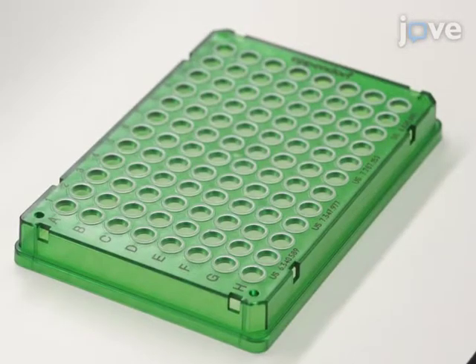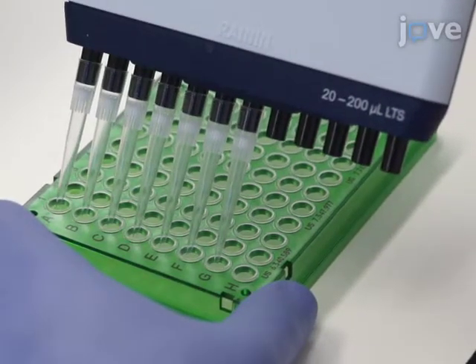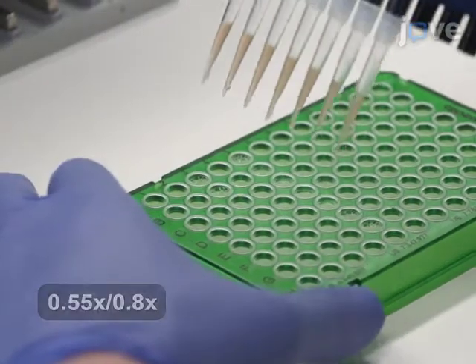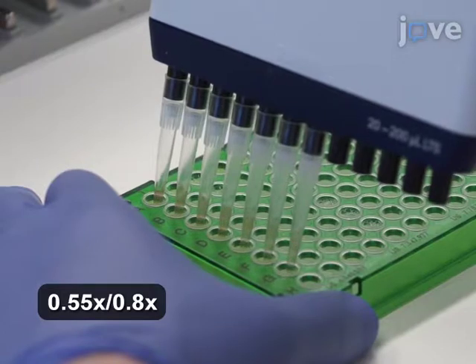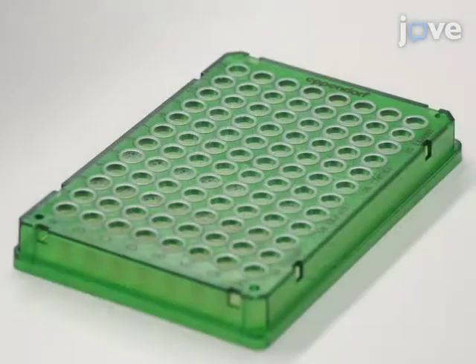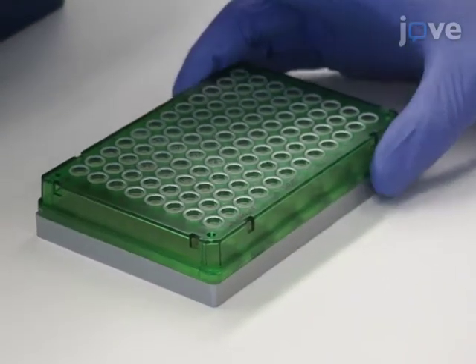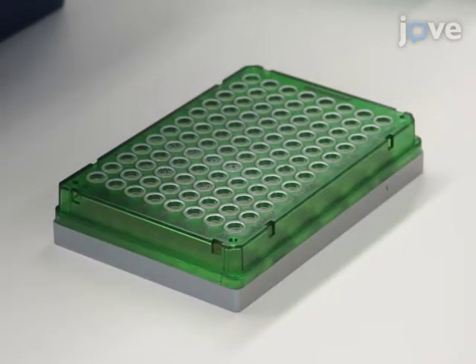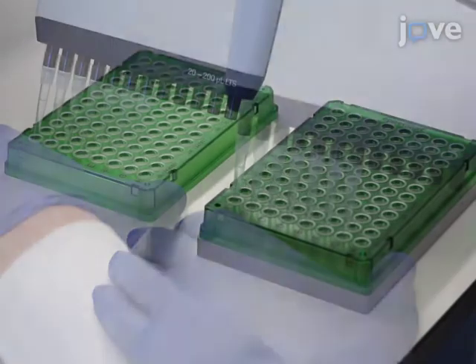After PCR amplification, remove the samples and bring the total volume to 100 microliters using nuclease-free water. Perform double-sided paramagnetic size selection by first adding 55 microliters of beads to each sample and mixing 25 times with a pipette. Then, incubate at room temperature for 4 minutes. Place the samples back on the magnet and incubate at room temperature for another 4 minutes to retain large fragments on the beads that are unsuitable for sequencing. After incubation, transfer the supernatant to a new 96-well PCR plate.